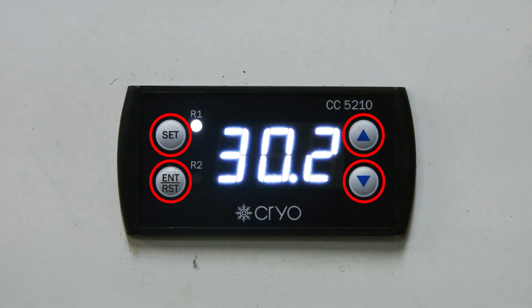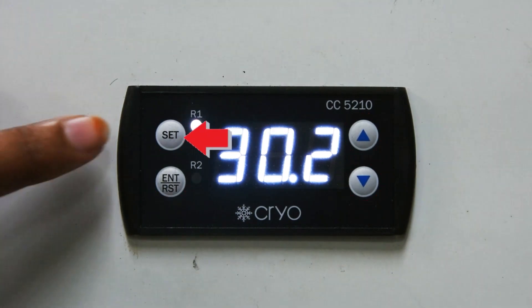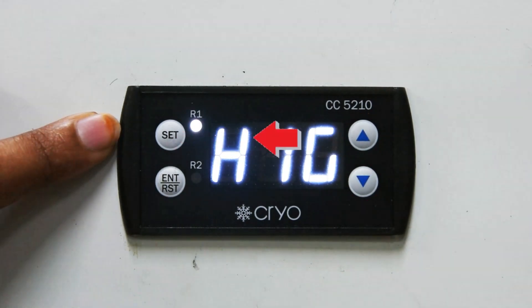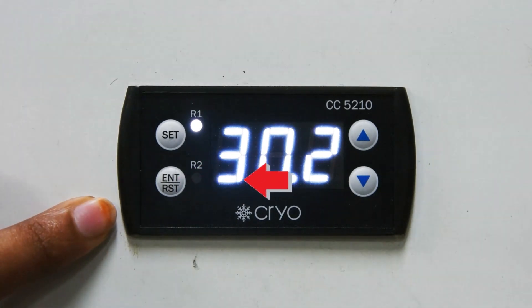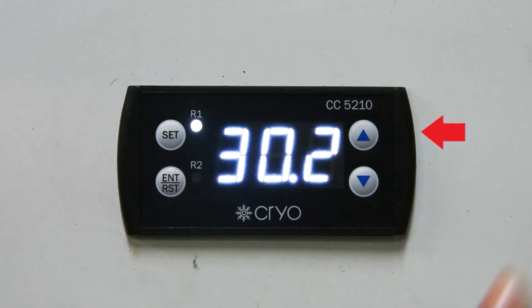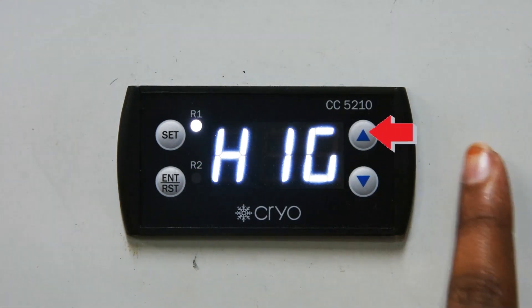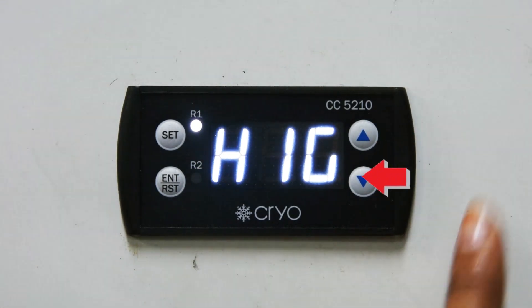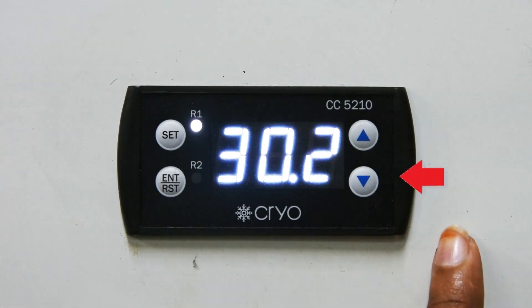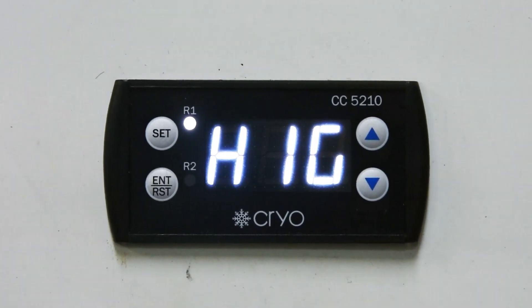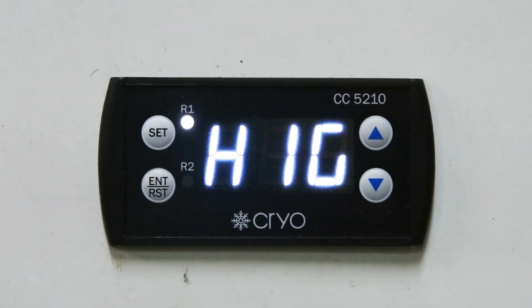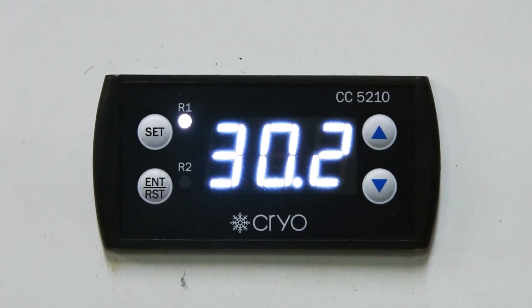There are 4 keys on the control panel: the first is the Set button, the second is Enter or Reset, the third is the Up key, and the fourth is the Down key. While setting the controller parameters, we can use these 4 keys to set the parameter.